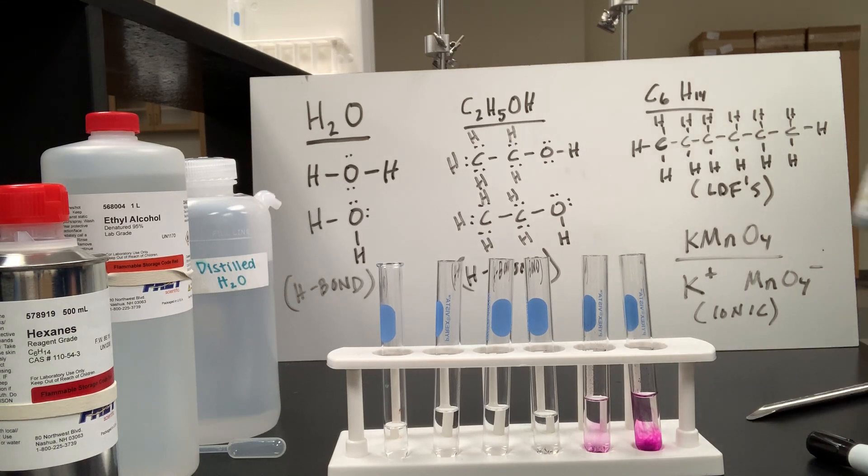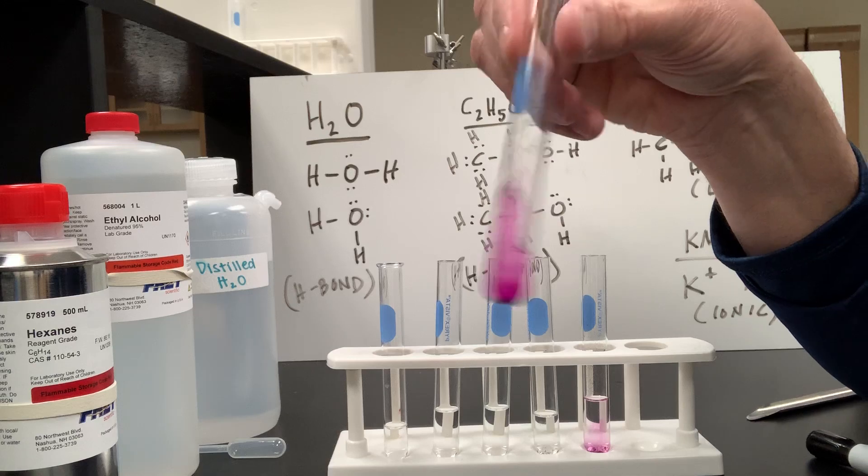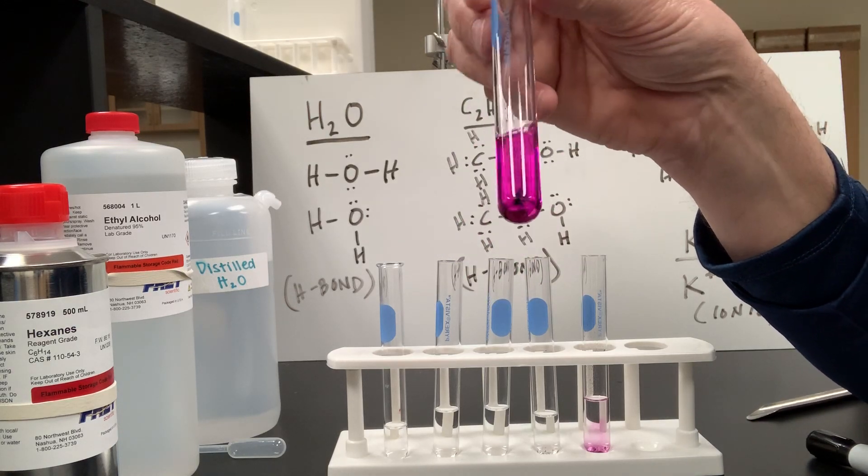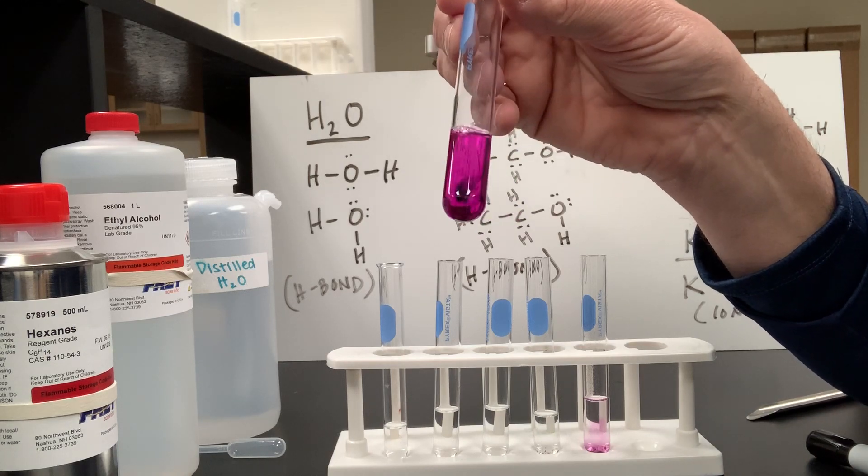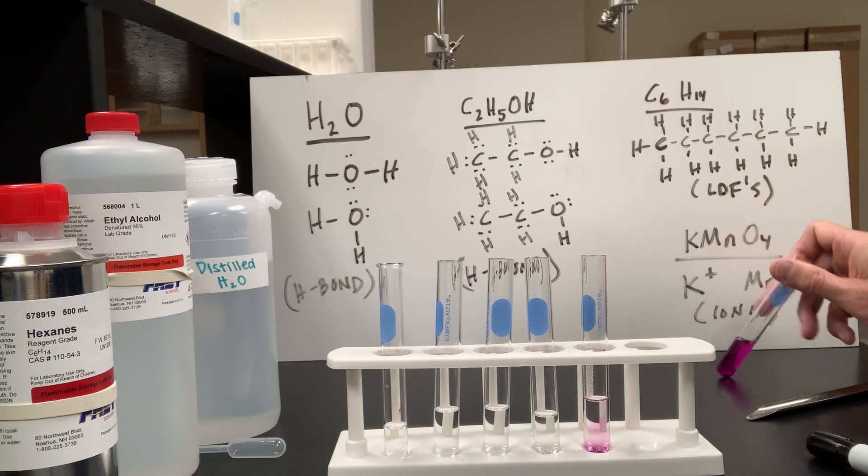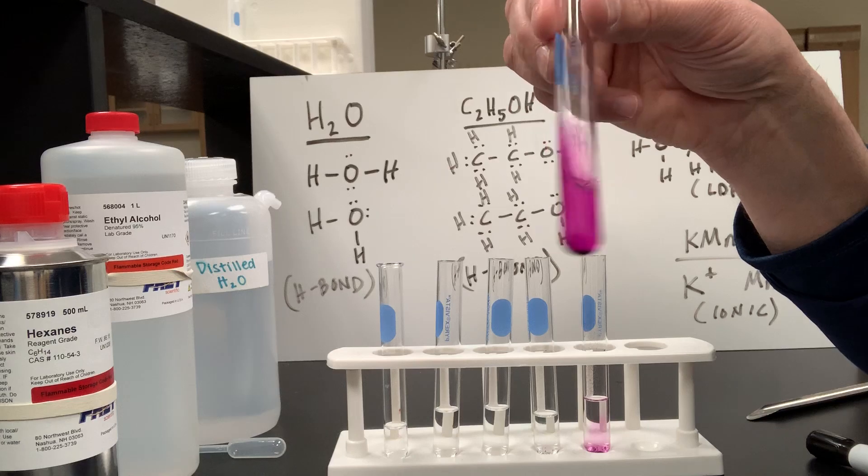And you should notice some differences between the three. Let's shake these up a little bit. And you'll see that potassium permanganate dissolves quite well in water. Now, that plays a role here. Water is a polar molecule. It can hydrogen bond and has a positive and negative end. Doesn't potassium permanganate also have a positive and negative end? They are, so to speak, like each other.